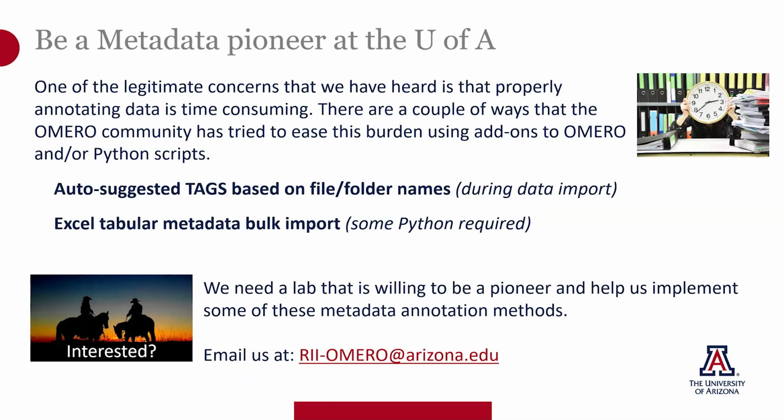To wrap things up, one of the legitimate complaints we've heard is that annotating data is time-consuming. There are ways that the OMERO user community has tried to ease this burden using add-ons, and there is an add-on that auto-suggests tags if you're doing nested folders. The add-on can read these and suggest tags to you.